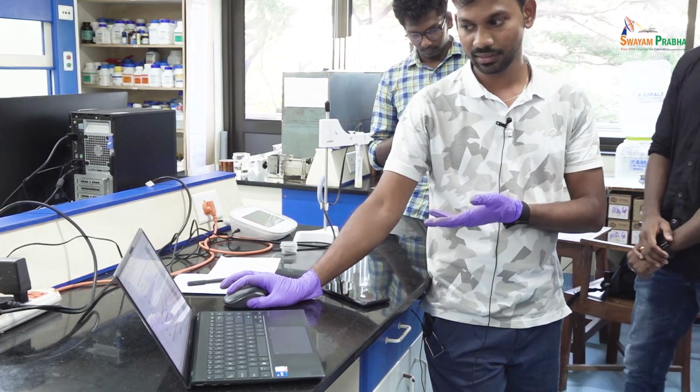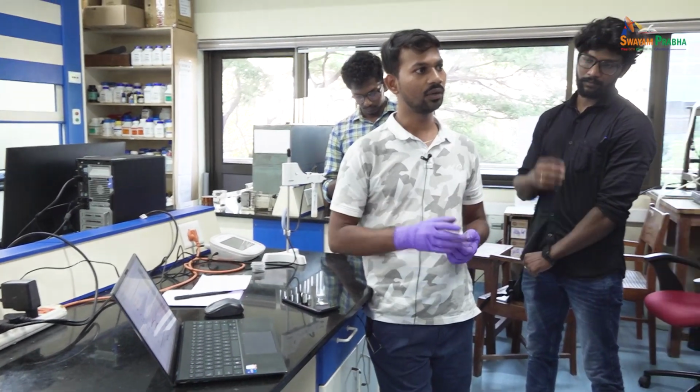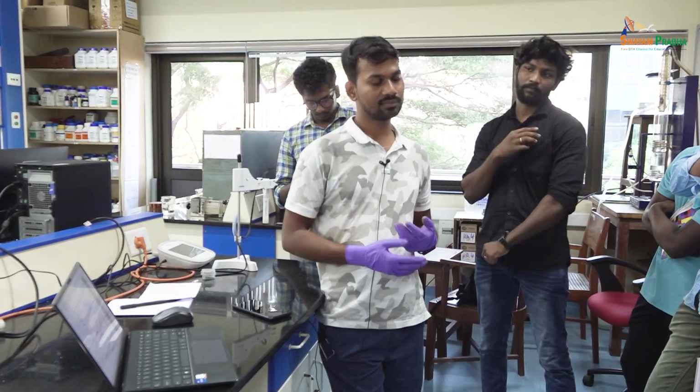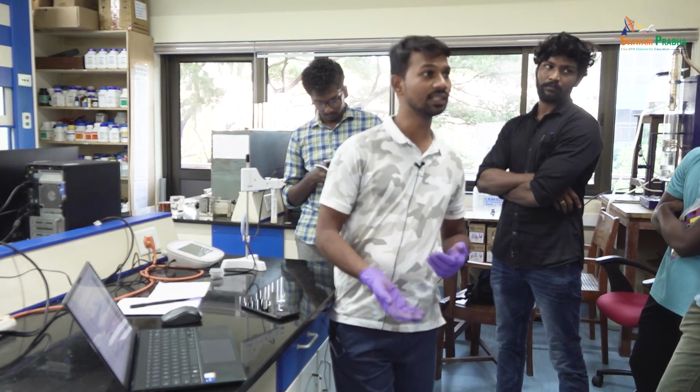I will draw a line and see how it is behaving. At that voltage, what is the passive current density, or whether the material is in the active region or passive, like that I can find out. It is used in bipolar plates in fuel cells.